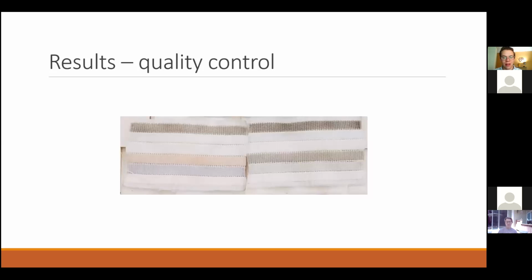The second thing that is worth mentioning is these 2 textile samples are dyed under the same conditions, same mordant concentration, same pH, yet we see two different colors. These two textiles, I believe this is polyamide and this is cotton, do not look the same at all.